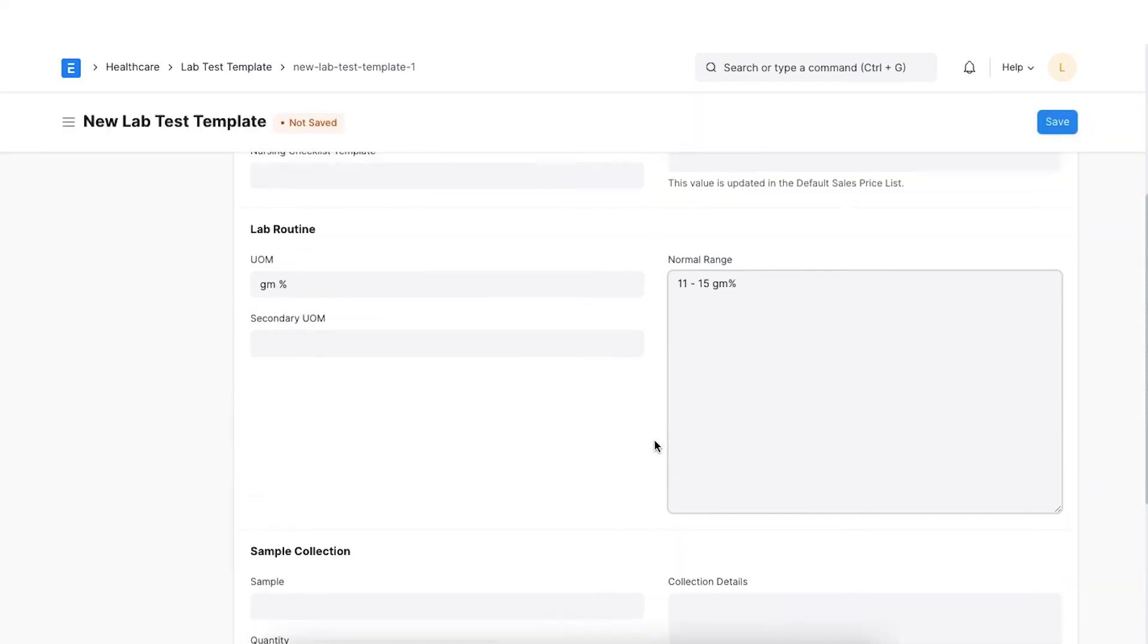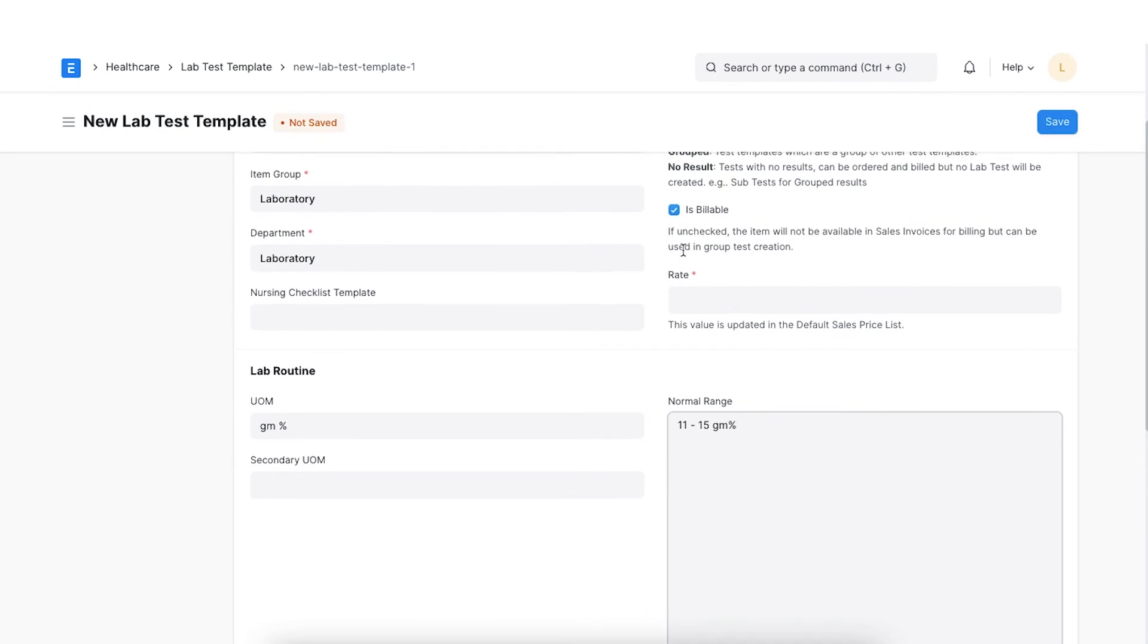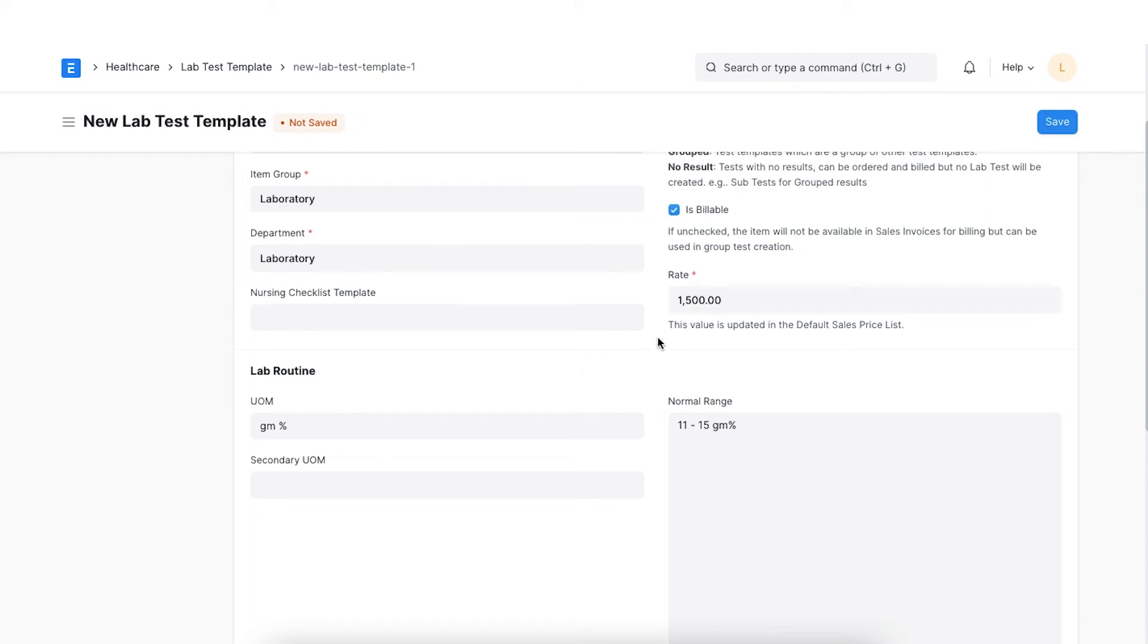If the test is billable, select this checkbox. Once checked, we will have to specify the rate for the lab test in this field. In this case, the item price will be configured automatically when the template is saved.